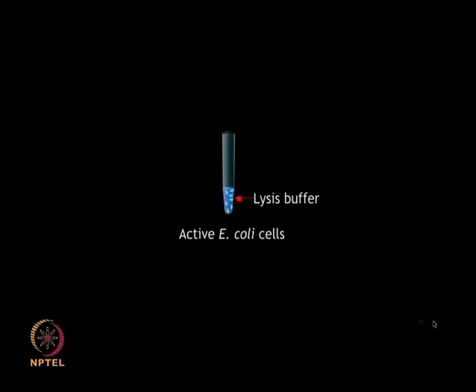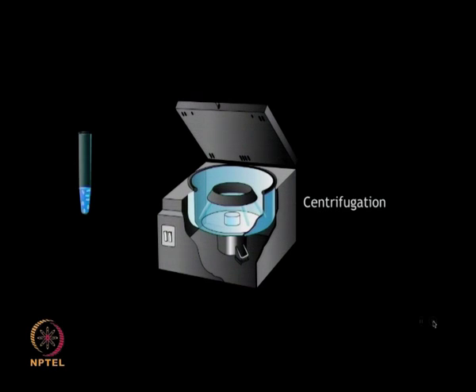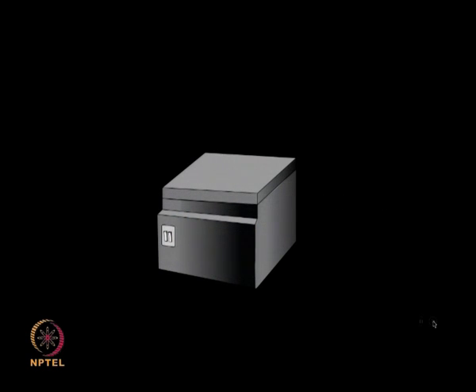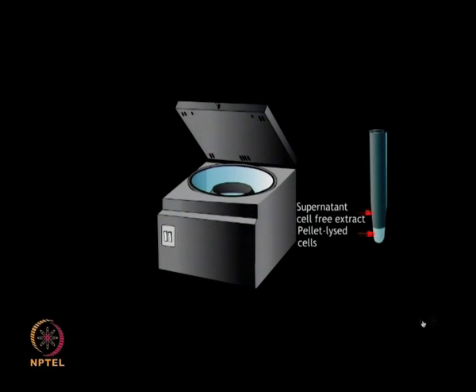The cells are lysed in a suitable buffer, and after that they are centrifuged at 30,000 g to collect the supernatant containing the extract. Now, this lysate, which is present in the supernatant after the centrifugation step, contains the cell-free extract.